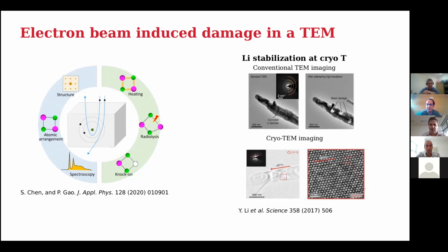Yes, people have thought about it. It's something that is more discussed, and I don't think it's really been tried. One of the limitations is that, first, you need a spin-polarized electron source, which seems to be available. But then you have to make sure that the spin of your wave stays the same all the way from the emitter up to your specimen.